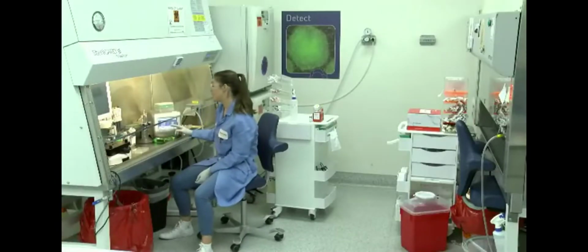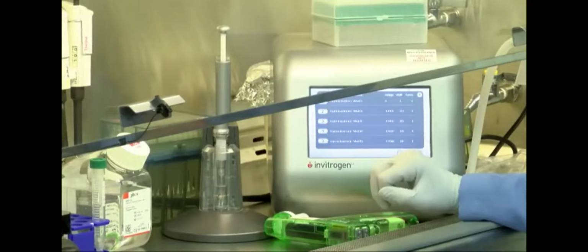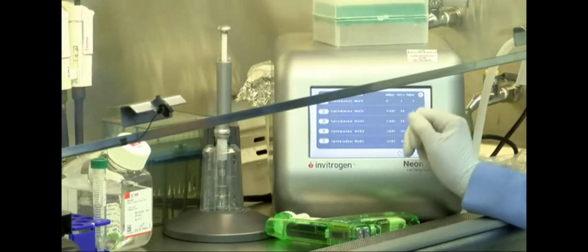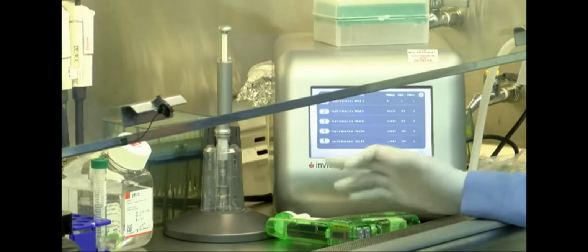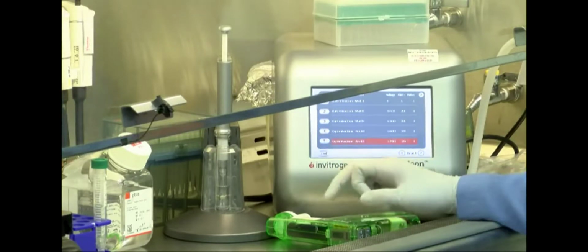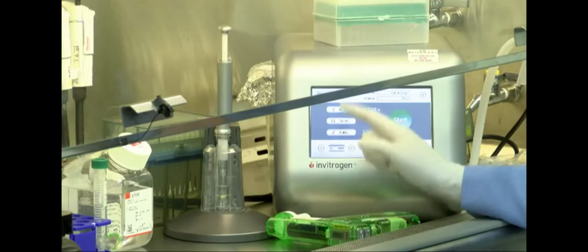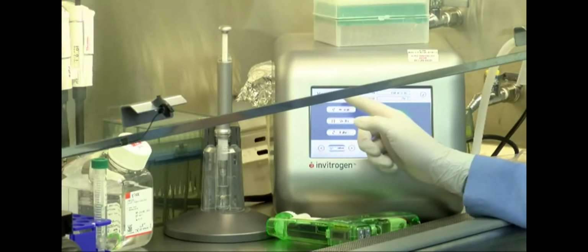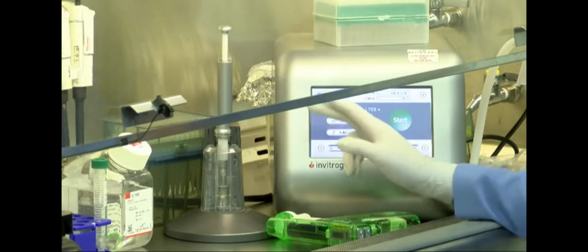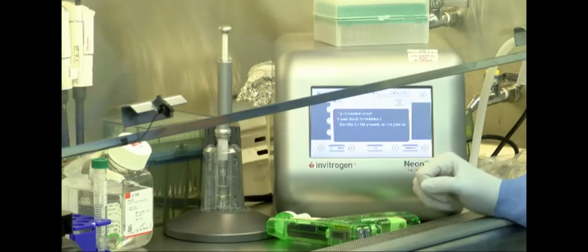Now if you go over to the Neon device, you can select your protocol by pressing the optimization button. And then all of the protocols will pop up and you can select the one that you want to run. For the sake of this training, I'm going to select option 5. And then I'm going to press load to load the protocol. You can see that protocol 5 is loaded up here. It displays the number 5. And then all you have to do is press the start button and the electroporation should take place.